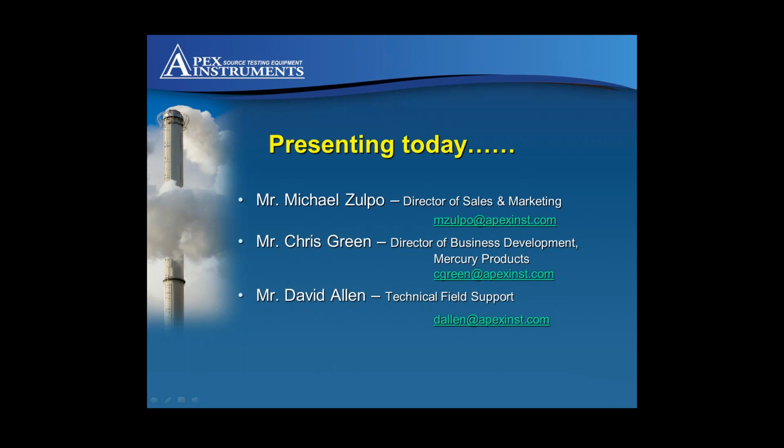And kind of on a sidetrack, since you brought up the topic, and Chris can show you this a little bit later, our system per PS12B is a closed system. So we actually collect the moisture content from the gas stream that we're sampling. We have petitioned the EPA to be able to do a gravimetric Method 4 on that moisture that we've collected. They've approved that for 30B testing, and we're still petitioning them to do PS12B testing.